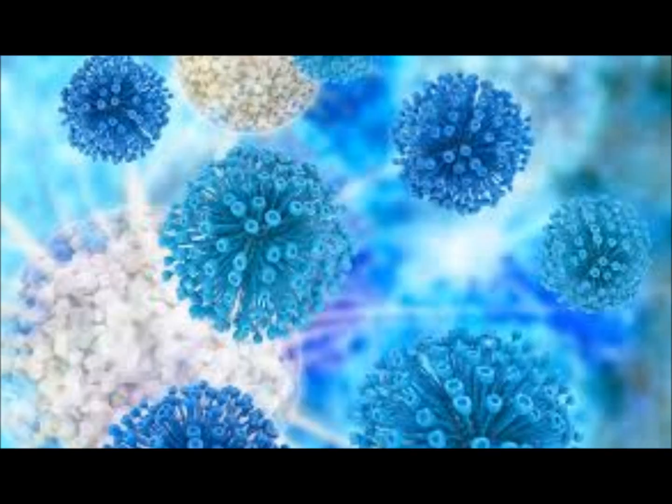You're going to have to see how your labs handle it. But a true lab, most labs are going to be very picky. If you have greater than 25 epithelials when you count them under low power, they're going to reject it and ask for recollection because it was too much saliva, because of all the epis. The problem becomes when you have greater than 25 epis and then you also have greater than 25 whites.